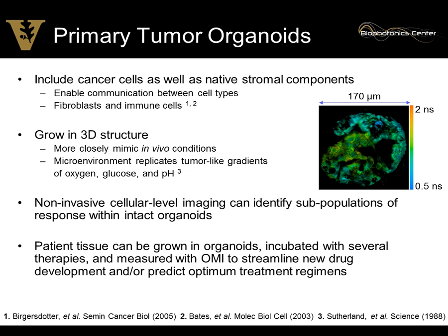So I've told you a little bit about these organoids, but I thought I'd give you a little more background. This is what they look like, for example, in the pancreas. They can grow very big, actually, from the pancreas samples that we get. The breast samples seem to grow a little smaller. So anyways, these include all of the tumor cells as well as any stromal components that we get in the tissue. So we don't exclude supporting cells. We include all the cells in these samples.